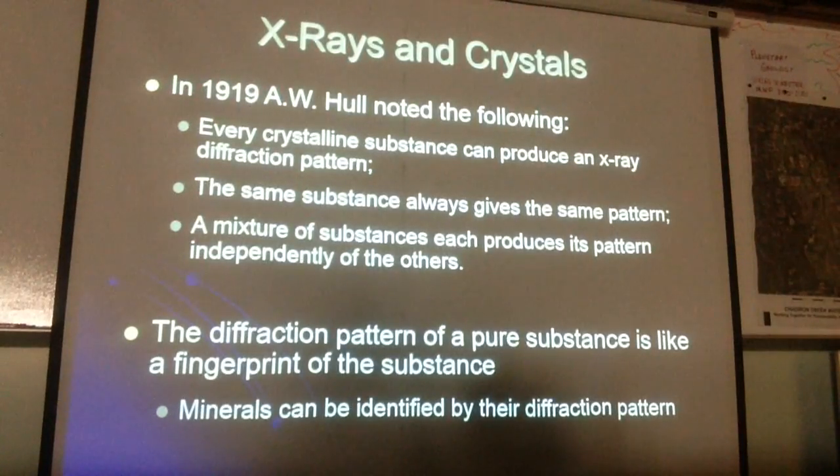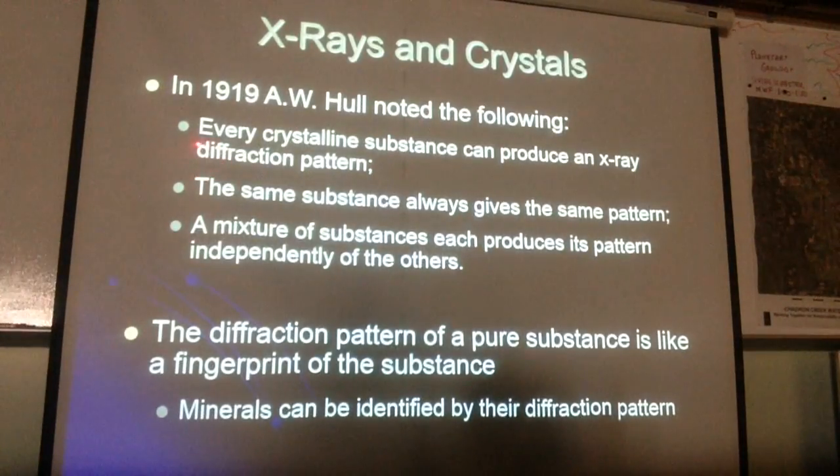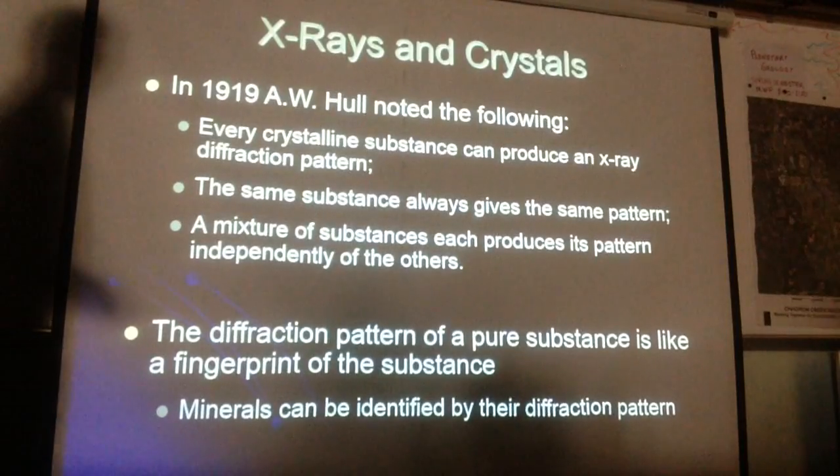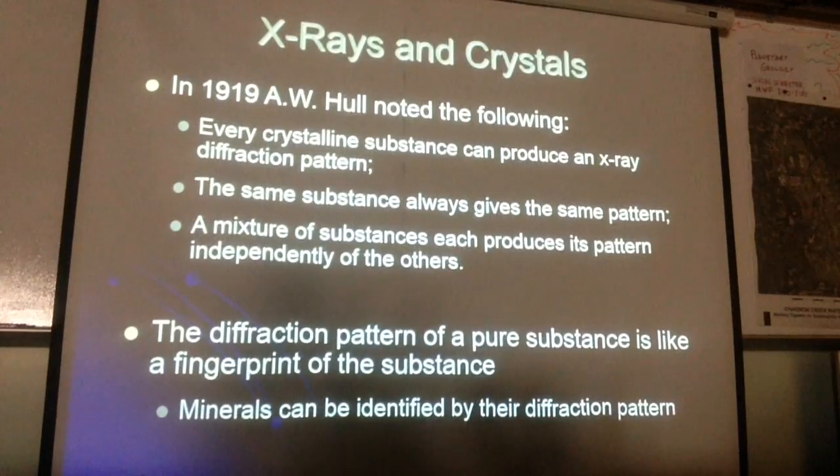Well, it started back in 1919 when A.W. Hull noted that every crystalline substance can produce an X-ray diffraction pattern. And the same substance always gives the same pattern, and a mixture of substances each produces its pattern independent of one another, although you can have some patterns that have peaks that overlap one another, and then things get a little trickier.